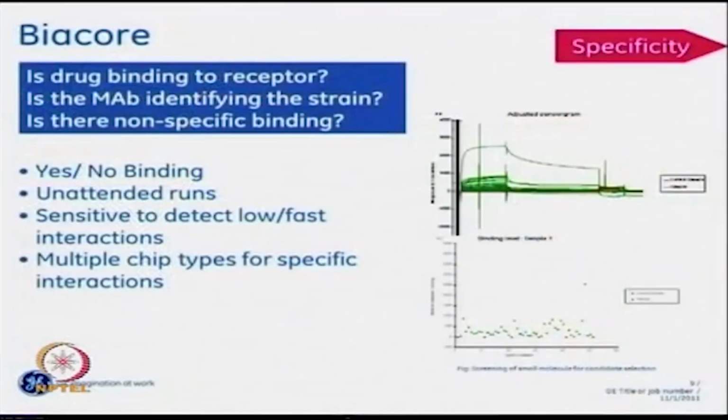But if you look at this presentation, I've highlighted one spot here with one molecule that's shown circled in red. This particular molecule is actually binding to the receptor. So at the end of a very short experiment of looking at the receptor versus candidate binding, you're able to determine which of these candidates is actually binding to the given receptor. A very simple example of specificity.